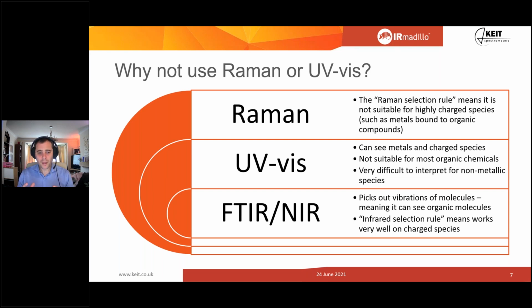UV-Vis looks at a different bit of the spectrum. So UV-Vis is great if you want to see carotene or chlorophyll, which I appreciate are useful in edible oils, for example, not so much in the fuels. Because of the way the structures are, the reason why carotene is bright orange is because it gets electronically excited by light. UV, visible, bright colors, green and chlorophyll, these are all linked. It kind of makes sense when you step back from it and think about it that way.